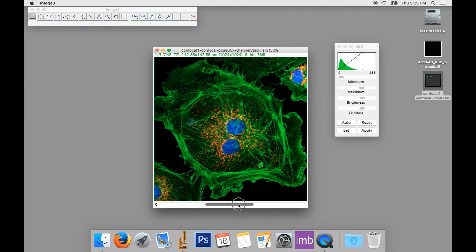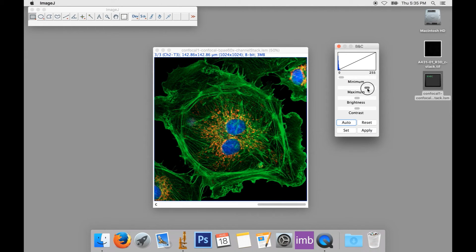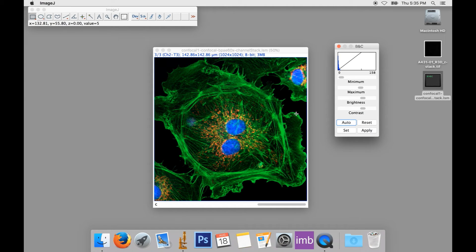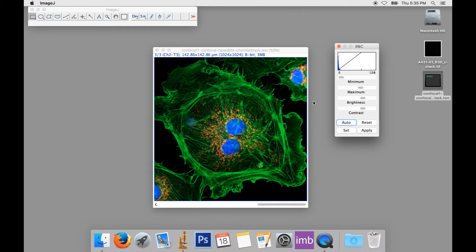And if I move to the blue, I can brighten up my blue channel as well. Now, notice that this image is not ready to print. If you want an image you can submit to a journal or use in a presentation, you'll need to follow the directions in the earlier tutorials in this series.